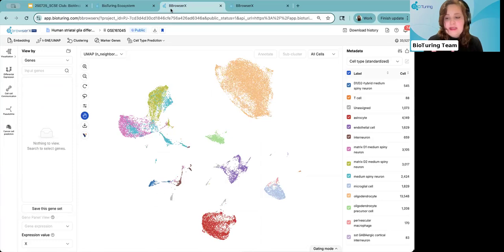When we're running a density query within the system, it tries to overlay a density layer in the UMAP or t-SNE embedding to visualize how these cells are distributed within a low dimensional space. It looks at each point on the UMAP for each cell and creates this density layer that gives you the local concentration of that particular gene in the UMAP, by using either kernel density estimation or a point density score.